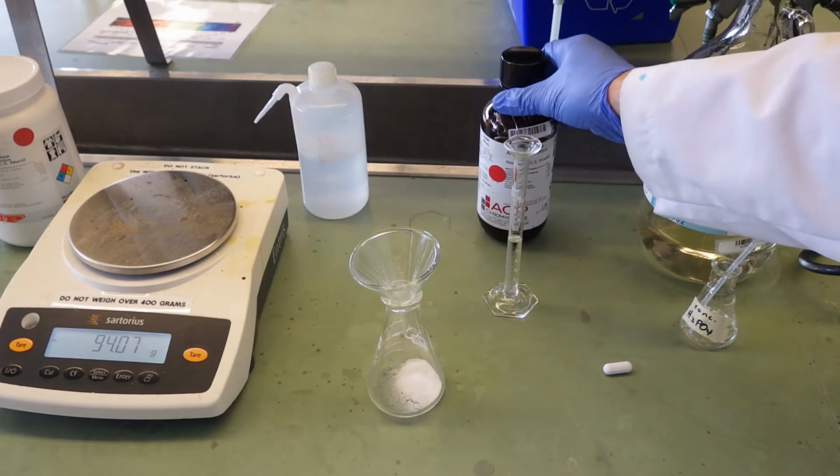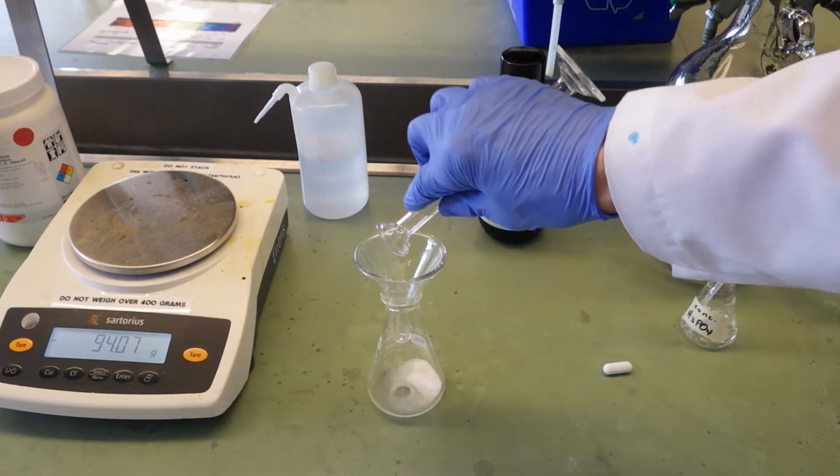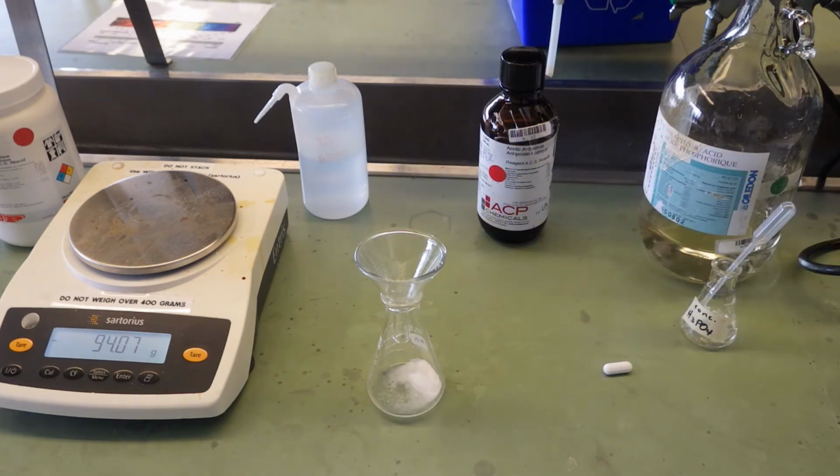Next, we're going to add about 6 mils of acetic anhydride. Notice again, we're going to use a powder funnel to make sure that the liquid gets into the flask and not on the lip of the flask. Now, acetic anhydride is added in excess, so I don't need to know the exact quantity.